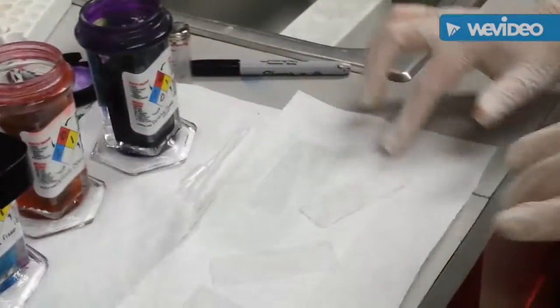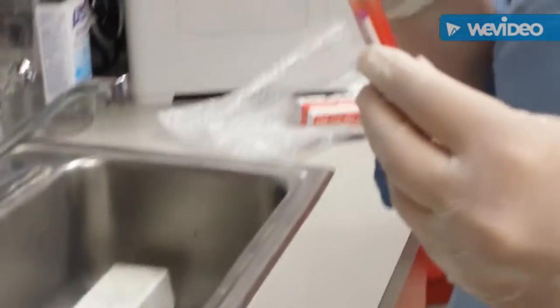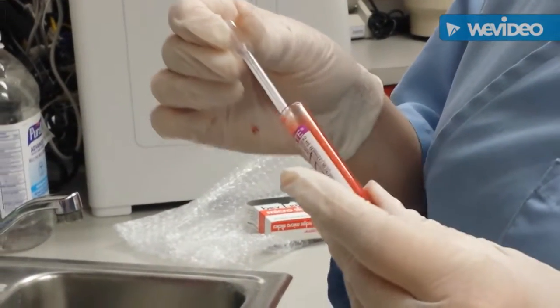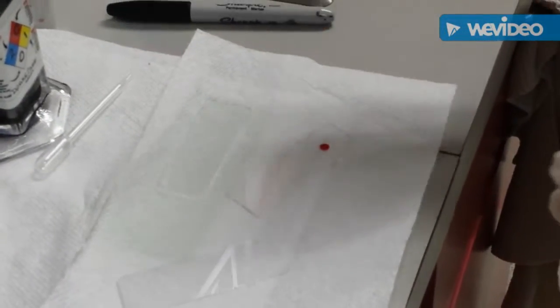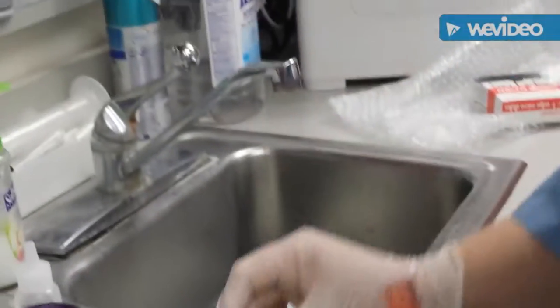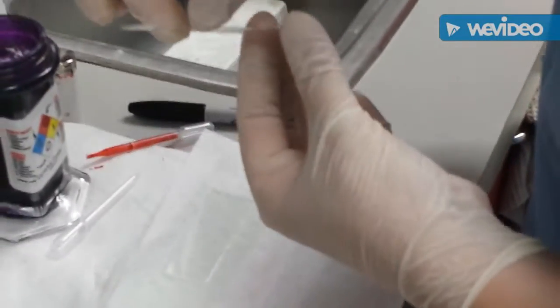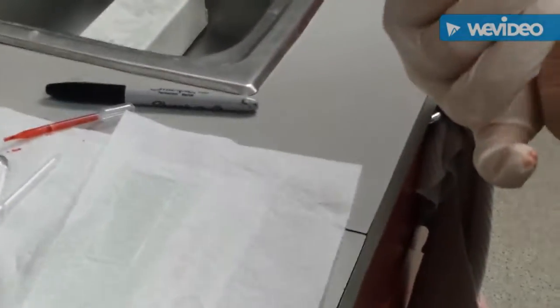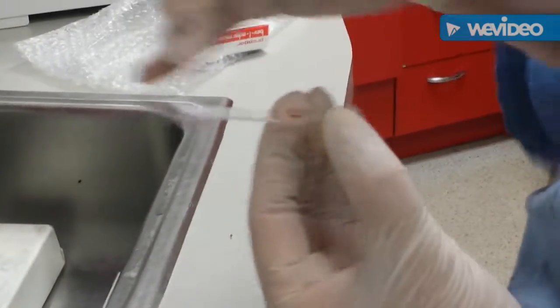Our slides do not have frosted edges, so we will use a marker to write their information at the very bottom. So we're going to use a pipette and just draw up a tiny drop of blood, and we're going to go ahead and just place this on our slide. Okay, so we're going to go ahead and pick this up and place it into our hand. Make sure we have a sufficient grip, but are still able to do everything we need.